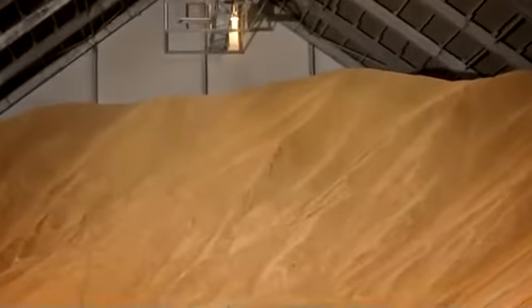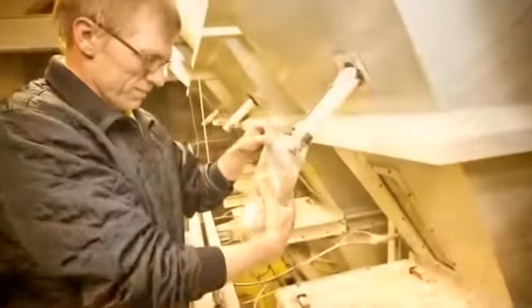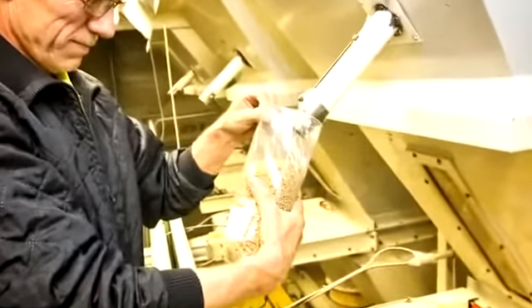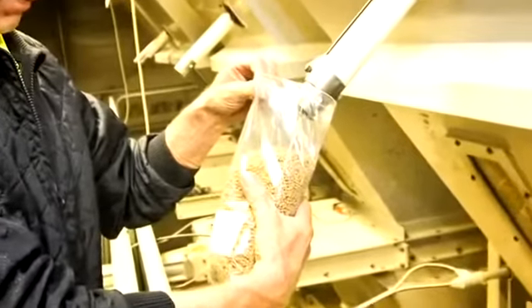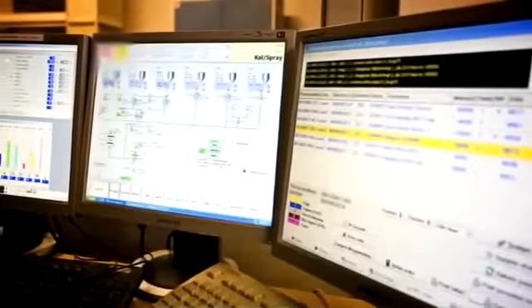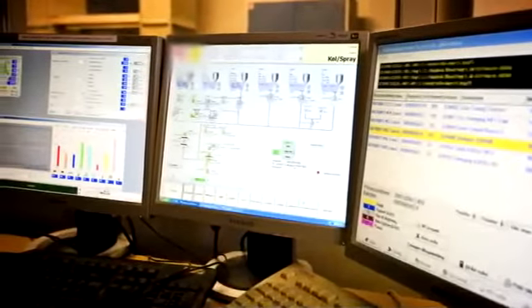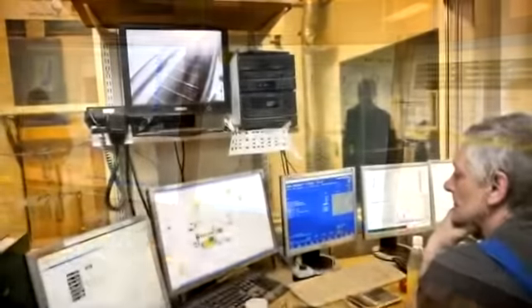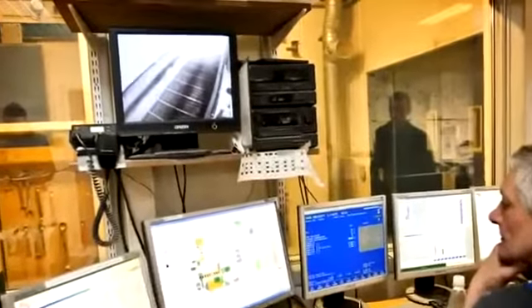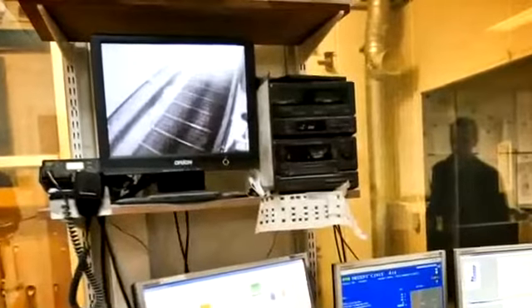If you take a feed mill, there's a lot of places where you can add value by going inline. You can say, okay, we have the raw materials, and we have the mix of the raw materials. And then, of course, if you go further into the process, then you make pellets and you maybe add fat. And yeah, there's a lot of steps. So identifying the most critical point is the first step, as I said before. In some types of feed, one of the important parameters is, of course, protein.